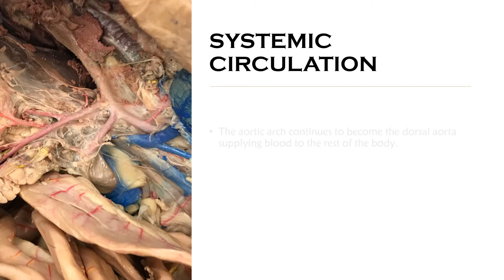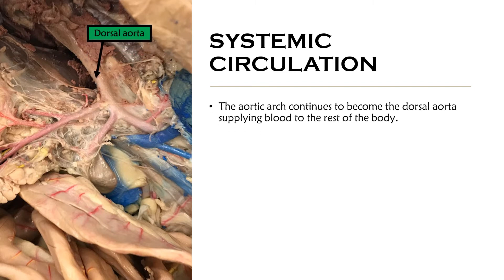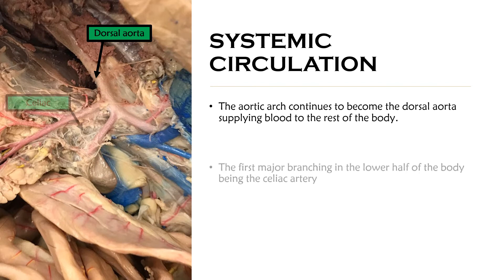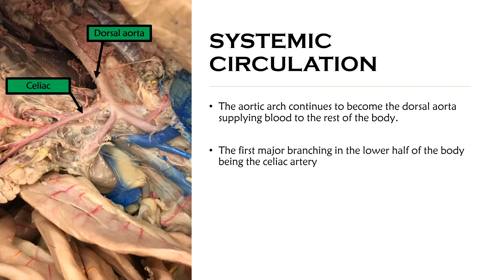Now we're looking at the lower half of the body. For context, we are looking behind both the liver and the stomach — they have been pulled to the side. The aortic arch continues to become the dorsal aorta, supplying blood to the rest of the body. The first major branch off the dorsal aorta is the celiac artery.